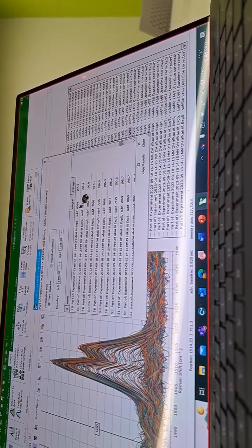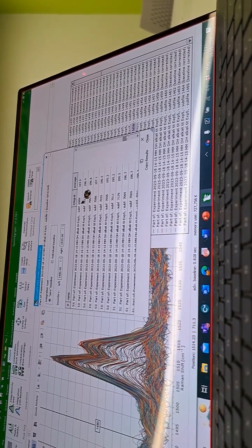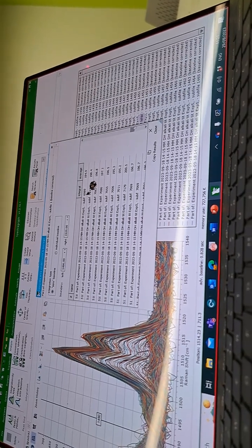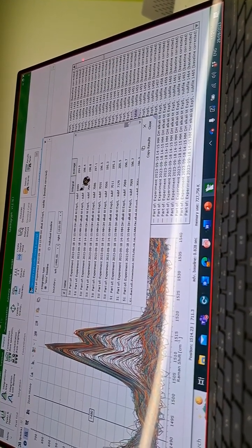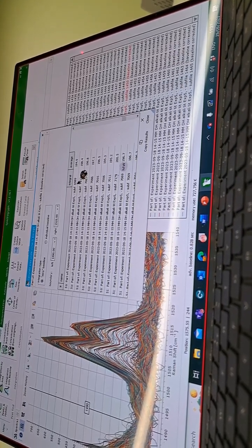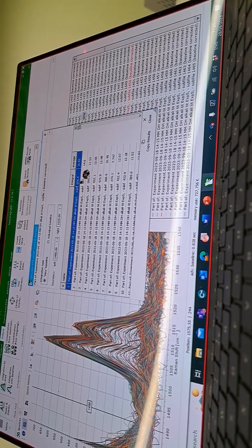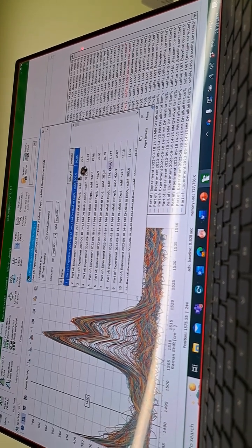Ideally, it should be 0, but there's always going to be some degree of signal within that region, because the baseline is not perfectly flat. It's associated with measurements. It can be jagged. When you have a look at where you've got an actual peak, it's up to 7,000. These are a few hundred.